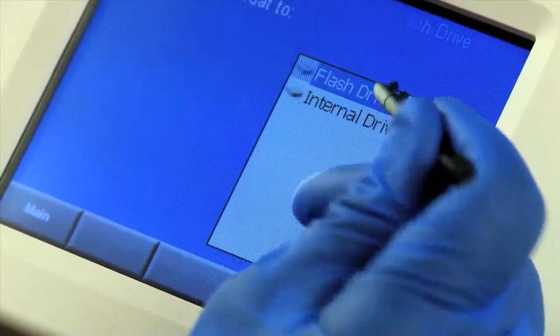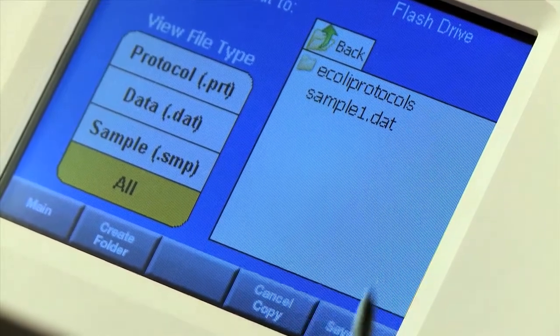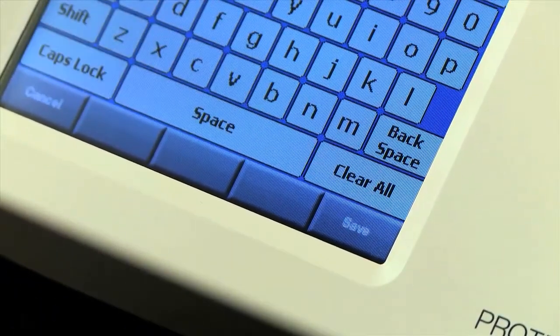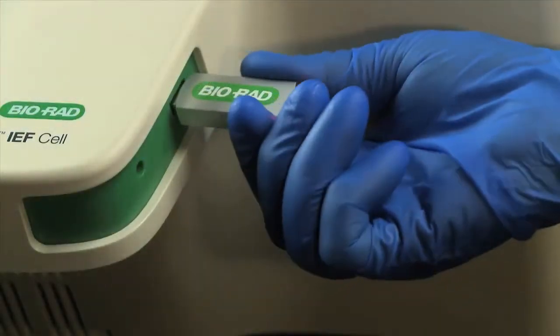To upload data.dat files to the Protein i12 Reporter, first load them onto the flash drive from the Protein i12 cell. Then, upload them into the application.